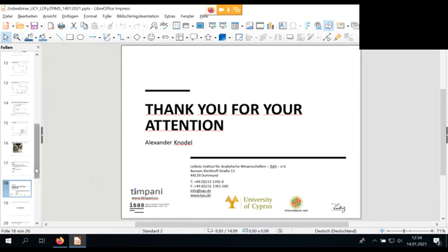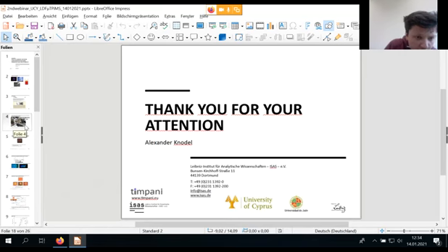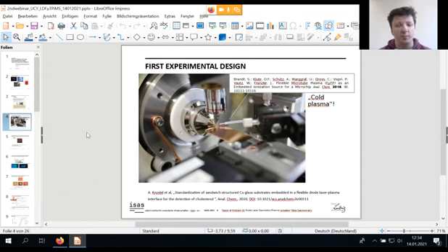Oh, yeah. Sorry, I didn't go that deep into the laser characteristics here, so I just pointed it out quickly. We were using a diode laser in the UV-vis, at 450 nanometers, in continuous wave operation mode. Okay, thank you. With intensities of roughly 10 watts per square millimeter.